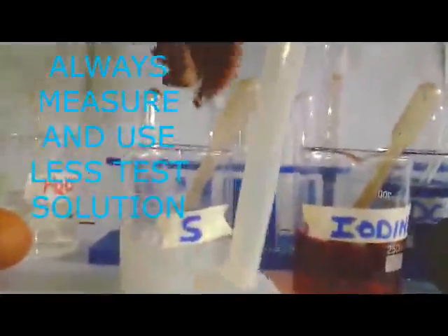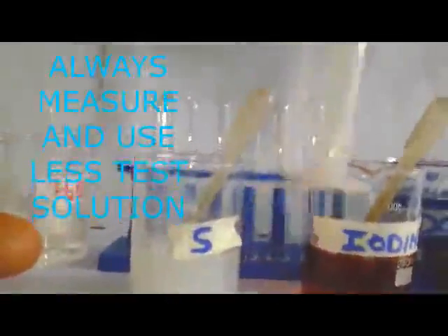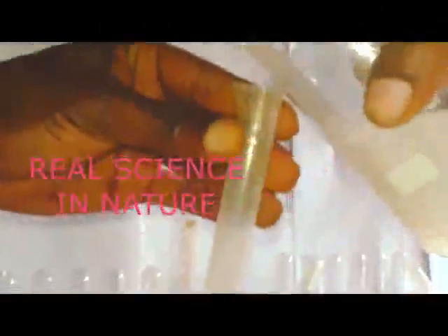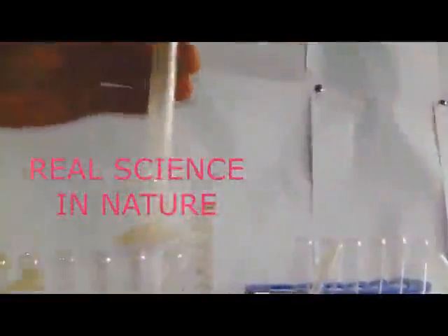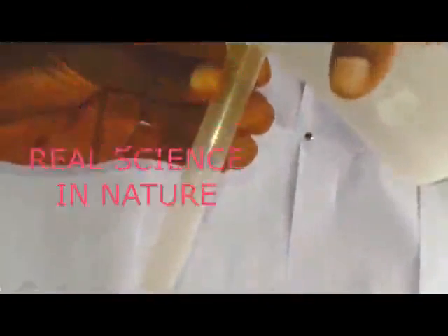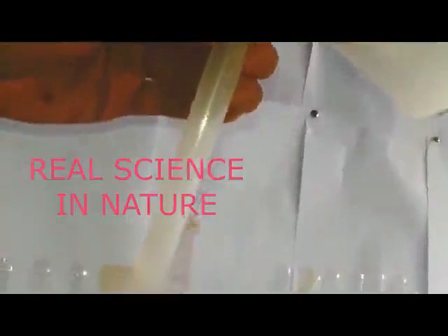That one is a 10 ml measuring cylinder. We get our measuring cylinder, then we pour our solution in properly. When you are pouring, make sure that you don't wet your working place.